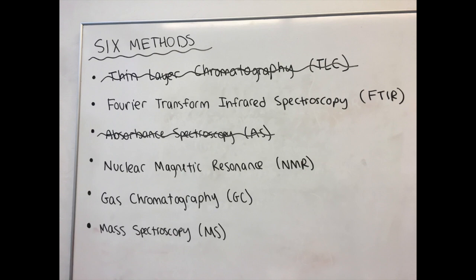AS is observed on an absorbance spectrum that shows the differentiating characteristics of the lambda max, or the wavelength at which molecules absorb the most photons. This can tell us how much and what types of electromagnetic radiation are absorbed because each substance generally has its own specific lambda max. It also is more quantitative than FTIR because it distinguishes between the lambda maxes of multiple substances within a mixture.